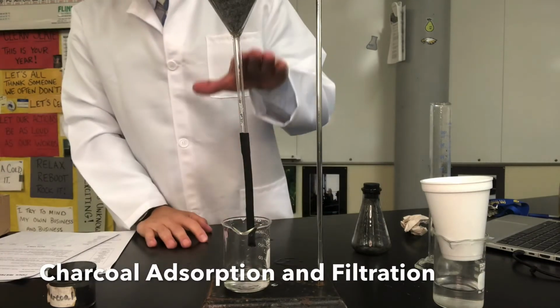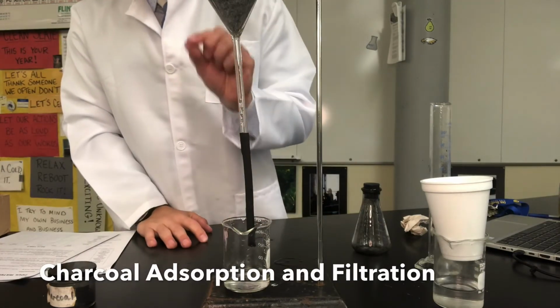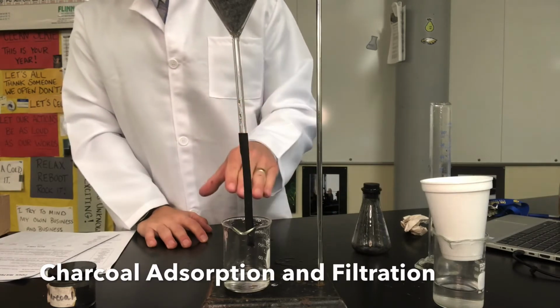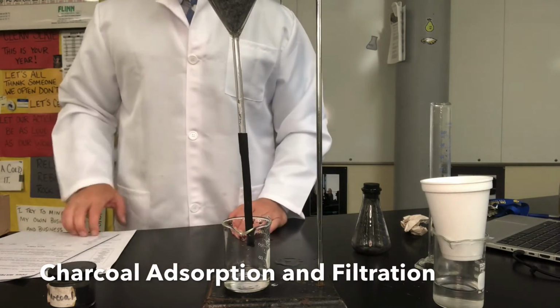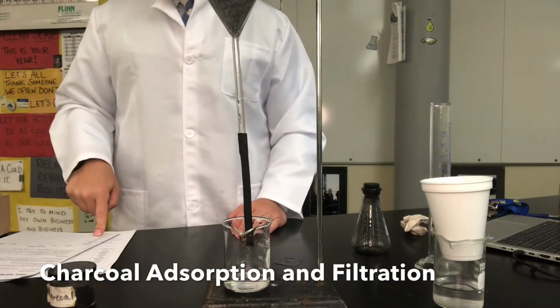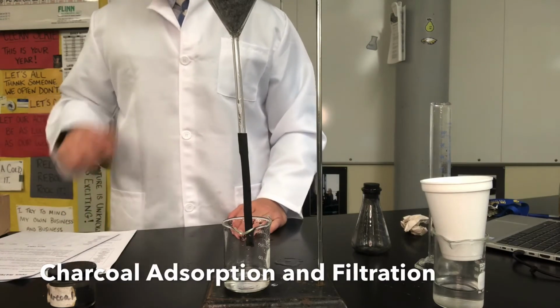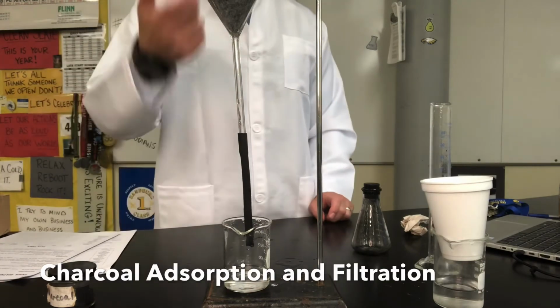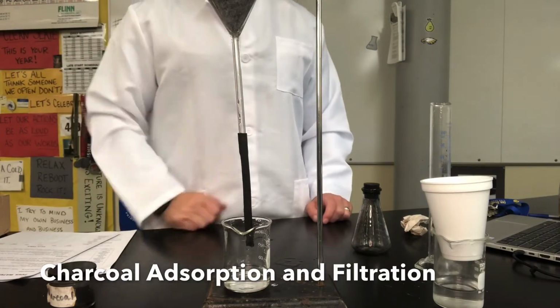All right, this is going to take a few minutes because this filter is so fine. So we're going to give this a few minutes to let the water leak out. And once we do, we'll finish up our data table, answering questions like the volume, the color, the clarity, and that. So take a quick break here. I'm going to turn off the camera, and we'll come back when we're ready to rock with our final sample.